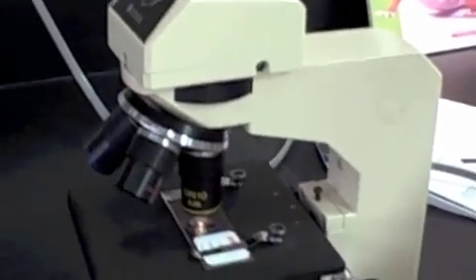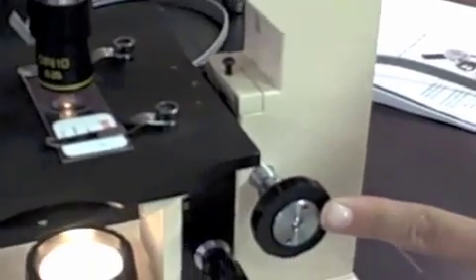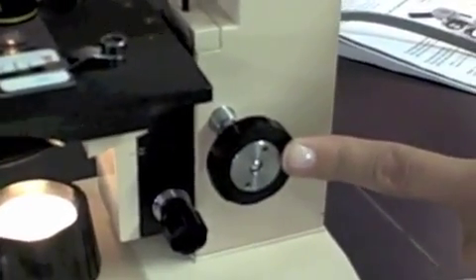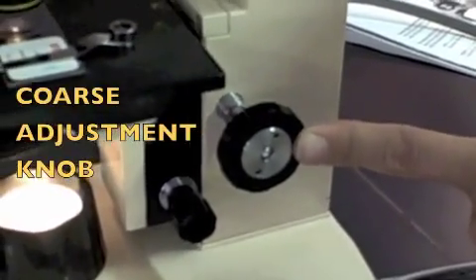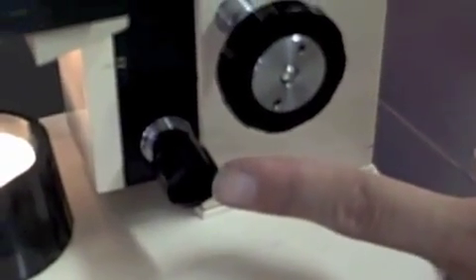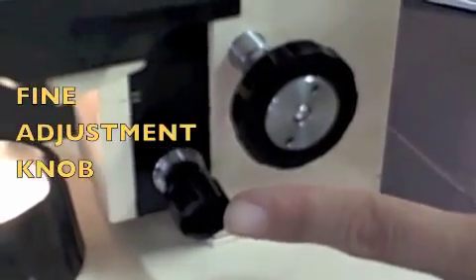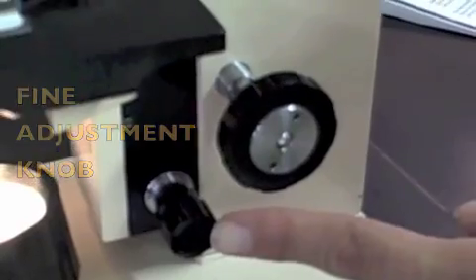Now when we want to focus, we're going to use those other pieces. What's the name of this piece? That piece is called the coarse adjustment knob. Perfect. And how about this one right next to it? That's the fine adjustment knob.